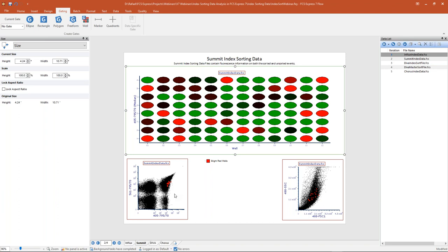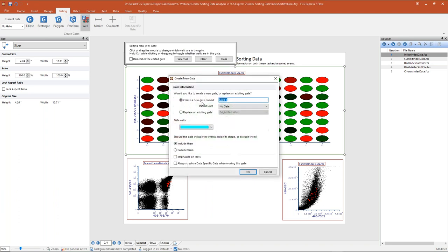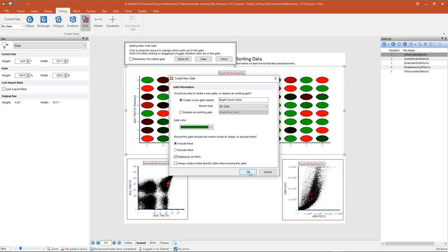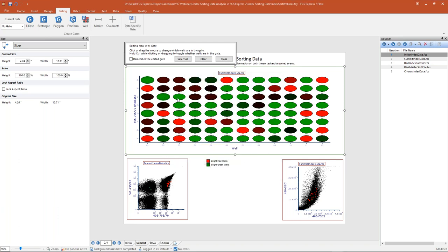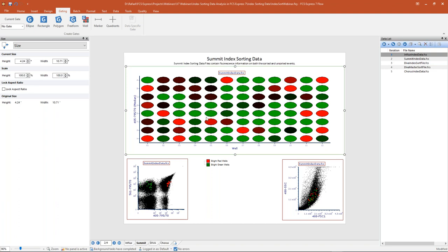We can explore where these cells fall on any parameter we've collected just by changing the parameter on these plots. Since we're not limited to making one gate, we can come back to our heat map and do the same thing for our bright green wells. I'll select my well gate and select multiple bright green wells, calling that gate 'bright green wells' with a green color, and again emphasizing those on the plots. As I hold down Control and select those different wells, they're backgating and showing up on my plots, letting me see where individual cells or groups of cells are falling.